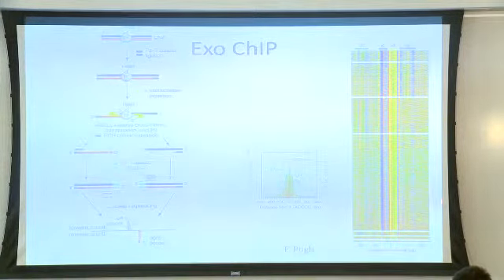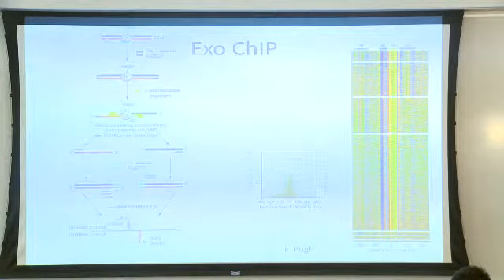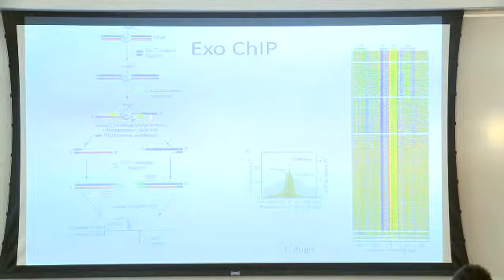So in this figure here, in which I guess I didn't capture the color scheme, these different colors represent different bases, A, C, G, and T. The fact that these columns occur once the data are aligned is an indication that the transcription factor has a very homogeneous binding site.